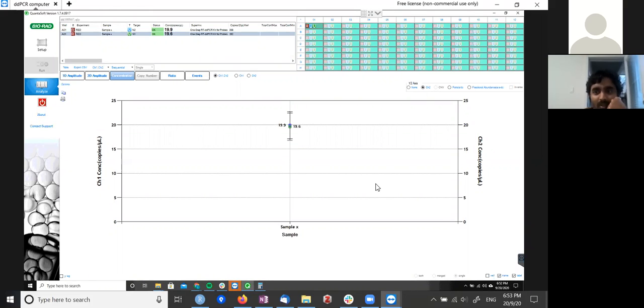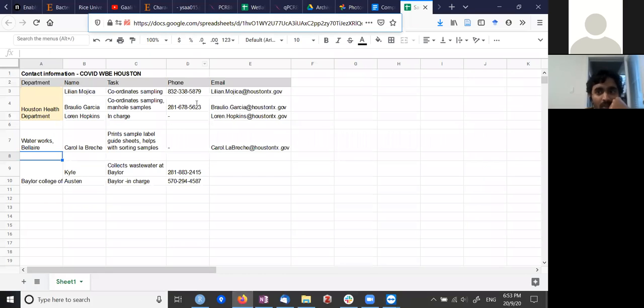Seems like someone else has done a ddPCR. I don't know who it is, so let me double check.